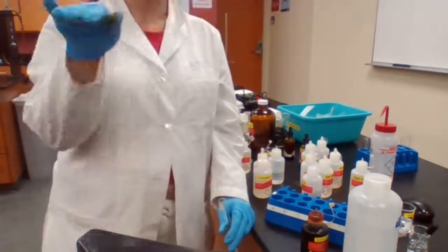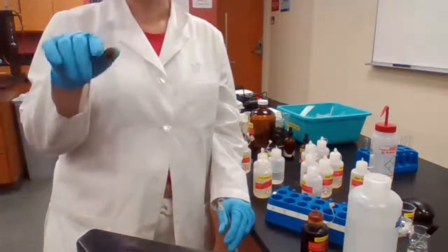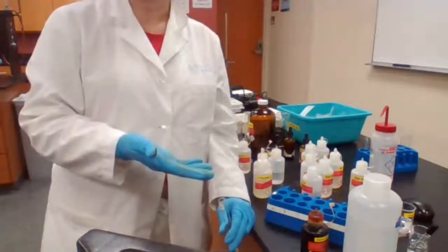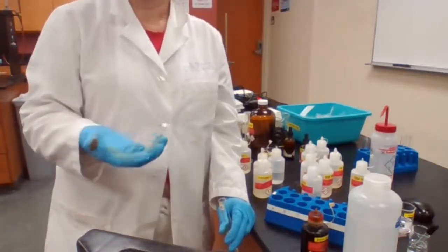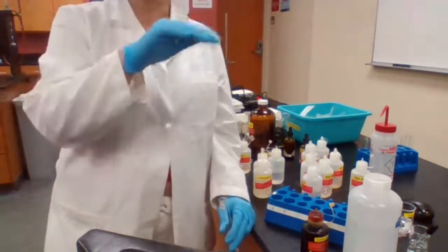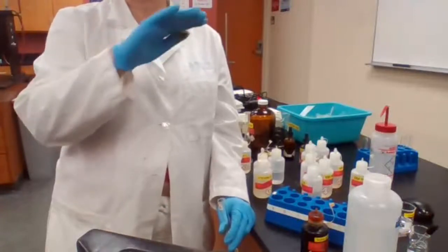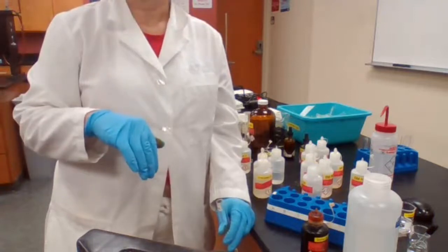For B, for the iodoform test, you just put either blank or you put NA, not applicable, because we didn't test B with iodoform. So you just put NA for that, or just cross. If you read the procedure somewhere, it should say either you put a cross sign, or you just make sure you don't put a positive. Yes.